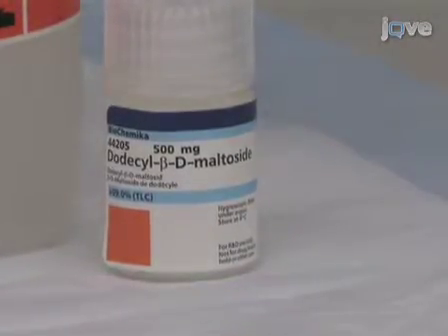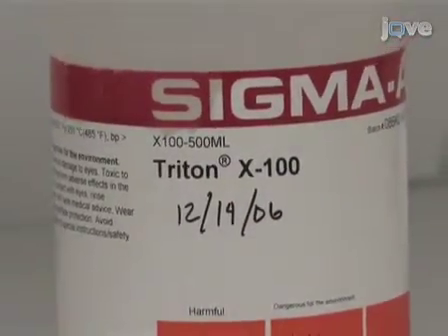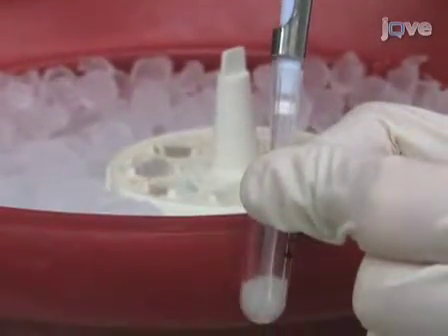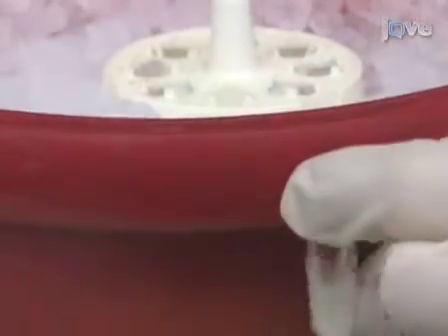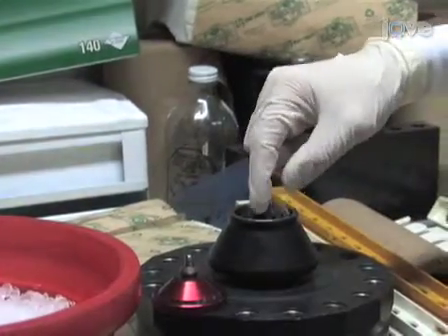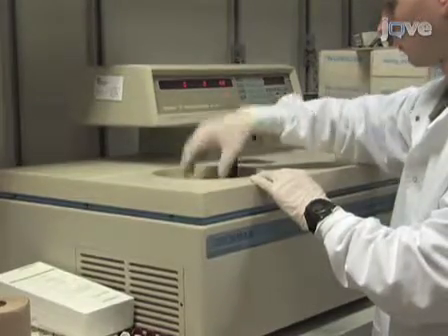Dodecyl beta-D-maltoside, or DDM, or Triton X-100, can be substituted for digitonin to solubilize proteins. The choice of detergent and its quantity may affect the formation of super complexes or multimeric forms of mitochondrial complexes. Following the incubation on ice, and once the pellet has been solubilized, we'll centrifuge it at 100,000 times G for 15 minutes at 4 degrees C.